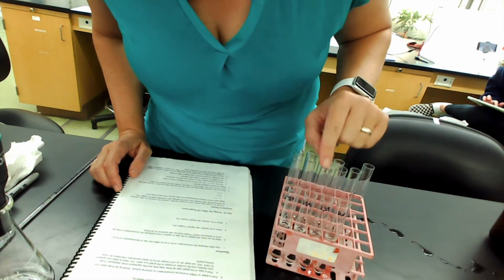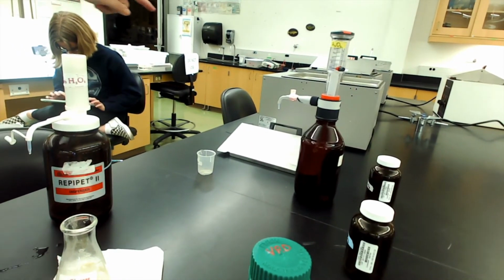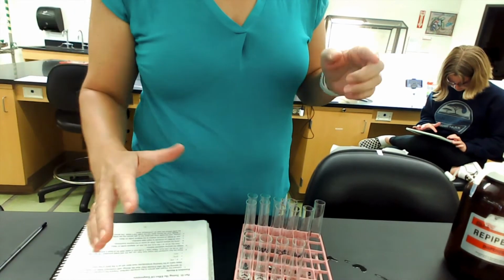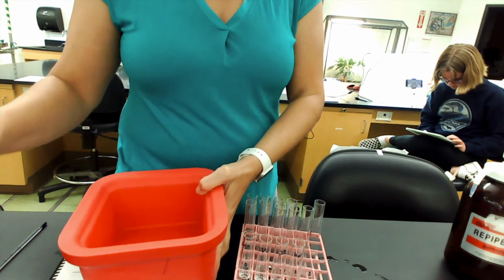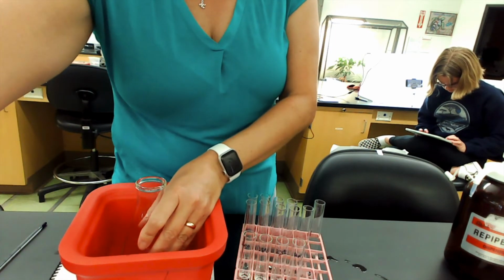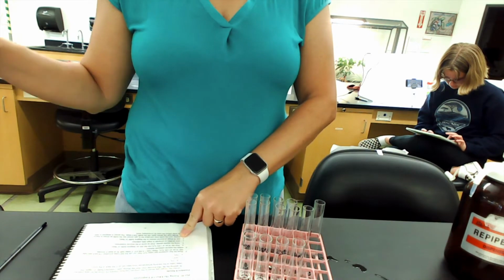I'm going to put all but the room temperature one in a water bath, which is set up down the bench here. This is a cold water bath, and then there's a warm and a hot one at the end. I'm going to put the tubes into those water baths for at least 5 minutes, if not longer. Then I'm going to make a mini water bath that I'll put the flask in that's at the same temperature to try and maintain that temperature. I'll add the enzyme for each one, which in this case is going to be 10 drops of enzyme, and then I will run all the samples on the computer.